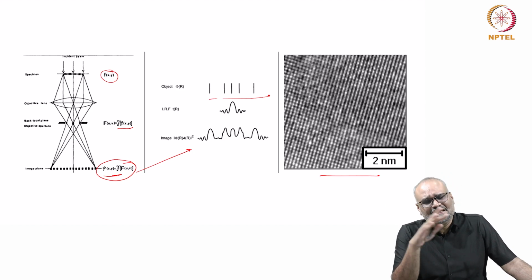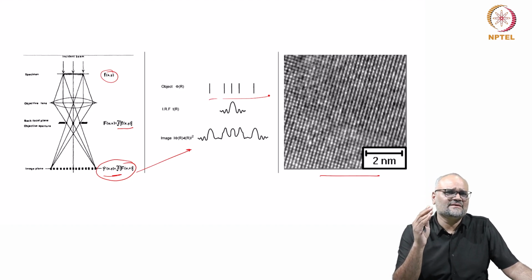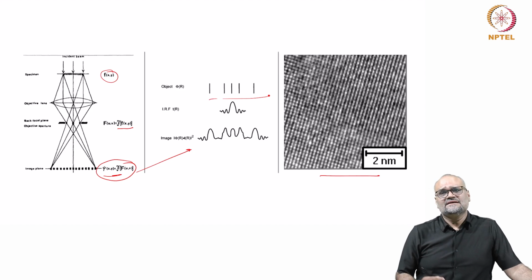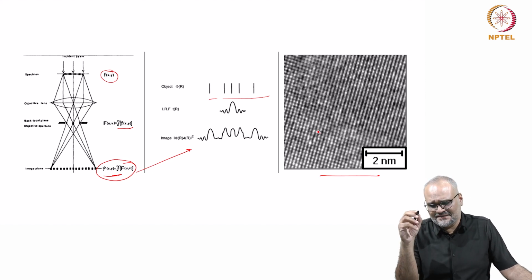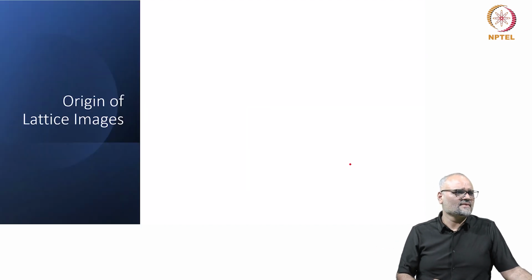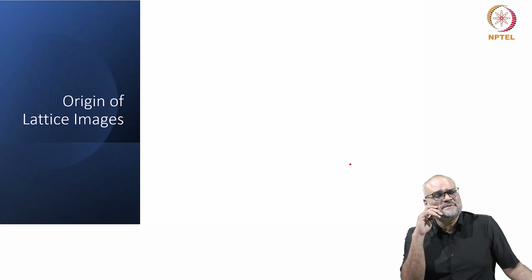Okay. So, we will now start seeing cases from two isolated scattering centers forming an interference pattern, and how we get the intensity and the phase information from this when we are recording high resolution TEM images. What is important to note, once again I re-stress this point, is that these dots that you see in these kinds of high resolution images are not really atoms, but this image is sort of an interference pattern. So, let us now look at the origin of these lattice images.